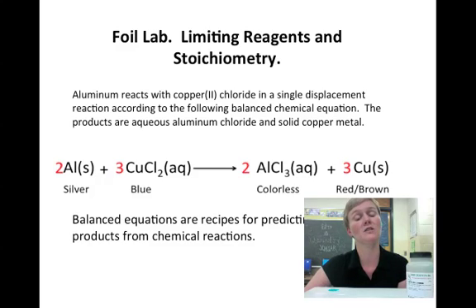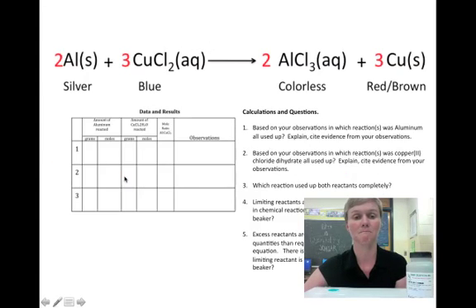Now we're going to actually focus on the amounts of reactants that we have here. Have you ever thought about what if you don't have the recipe based on the balanced equation? What happens? This is your data table that you will need to fill out as you go.